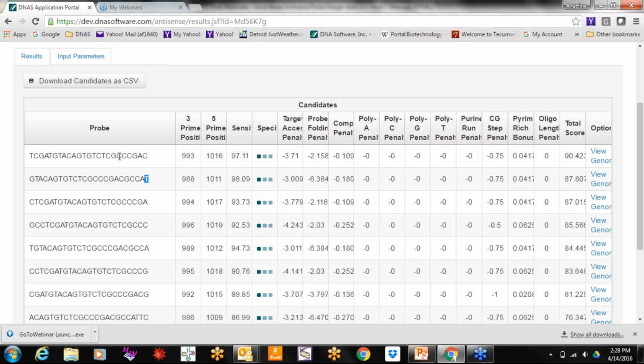So it won't be penalized as much for having 3 cytidines in a row, but it is being penalized for having 6 or more, by having all of these purines in its composition. We also have any of the polys. Again, it triggers for anything that has more than 3 nucleotides in a row. None of these have that, so the penalty is all 0.